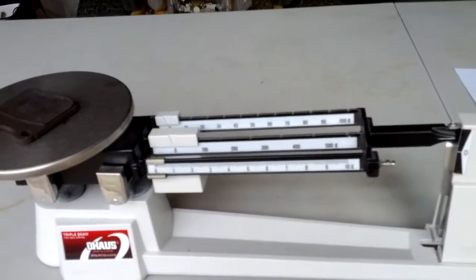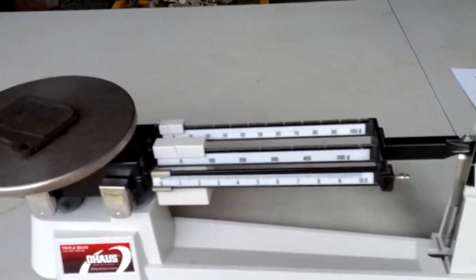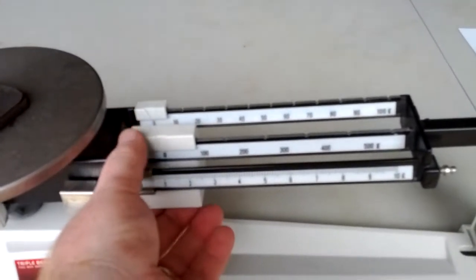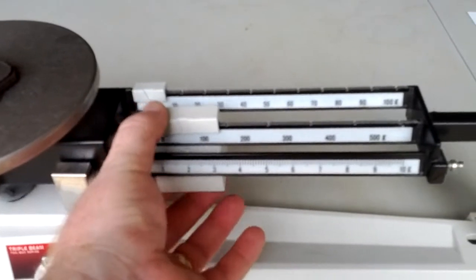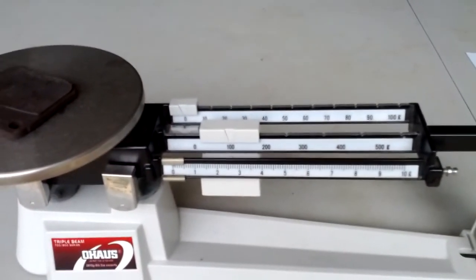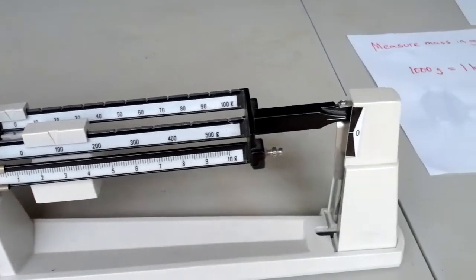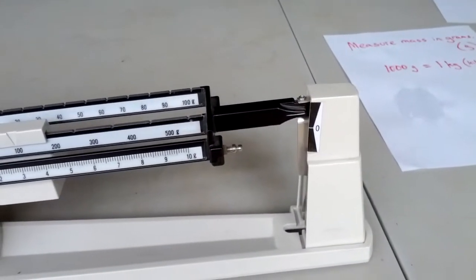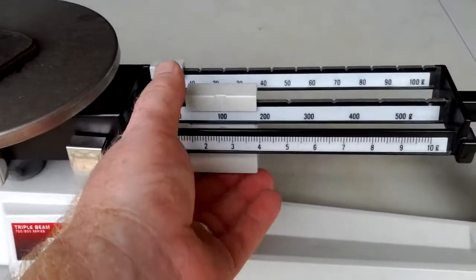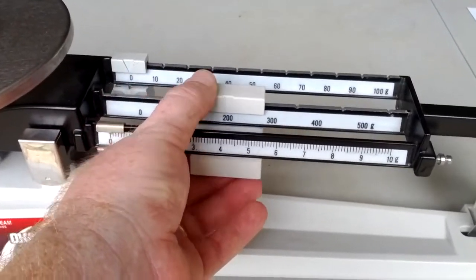Now you start with the hundreds rider. And you slide the hundreds rider one notch at a time. So first, I'm going to slide the hundreds rider over to 100. And when I slide it over to 100, my balance is still all the way at the top of this scale over here. So I need to slide it over one more notch.